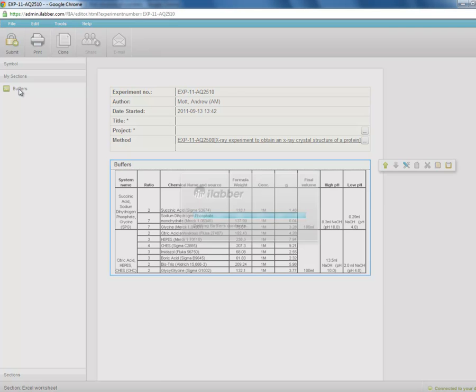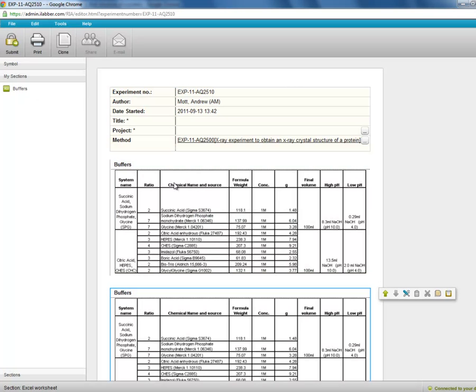You just double click on it and the section comes into the experiment underneath the highlighted section. So here we can save sections and use them again and again adding them to various experiments.